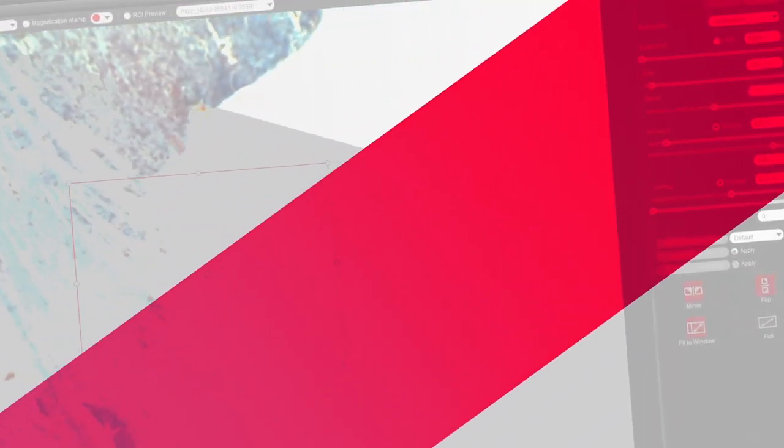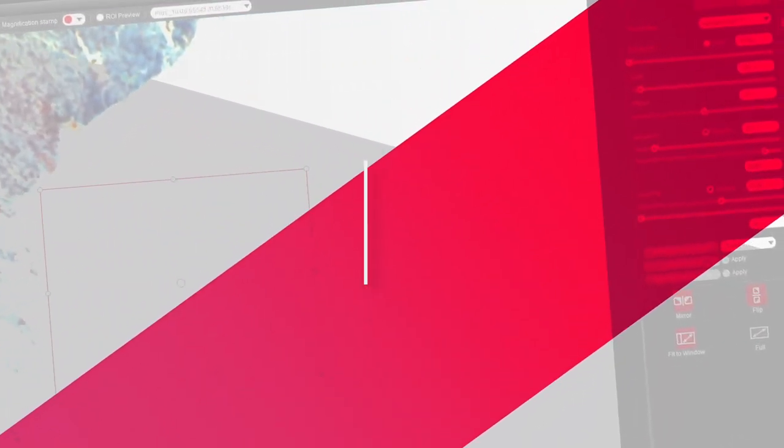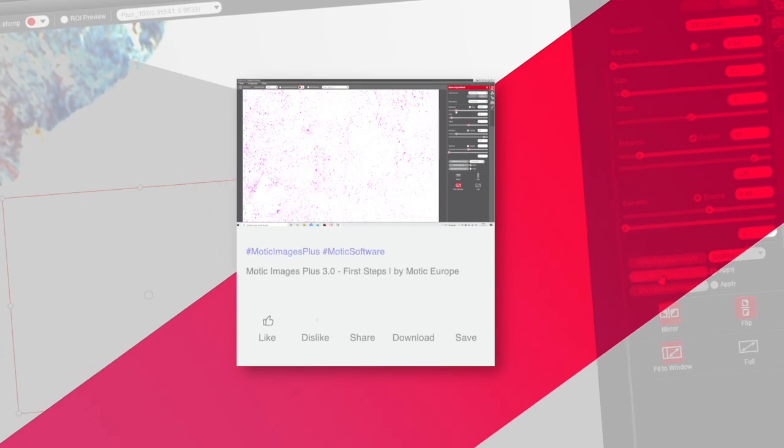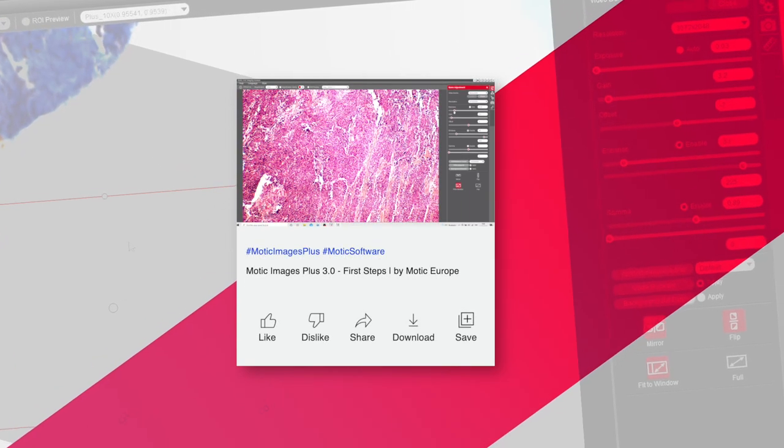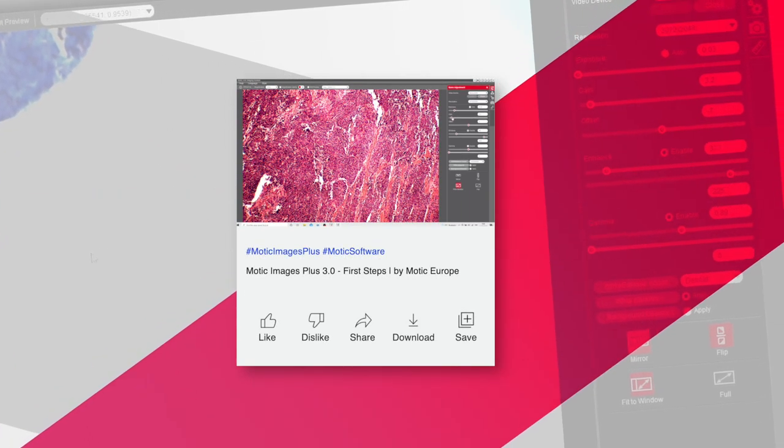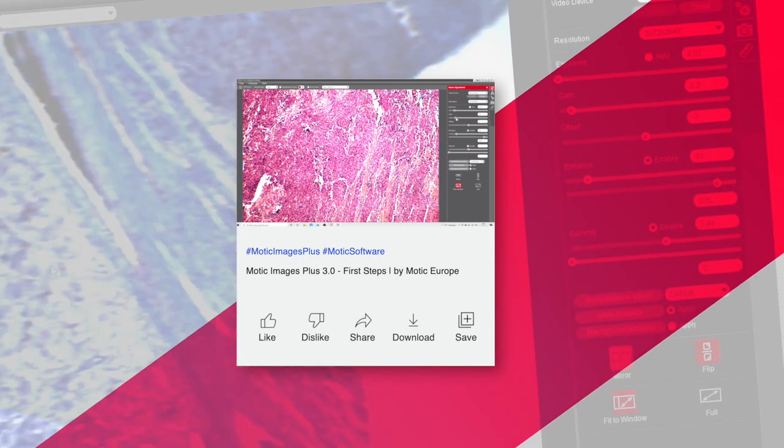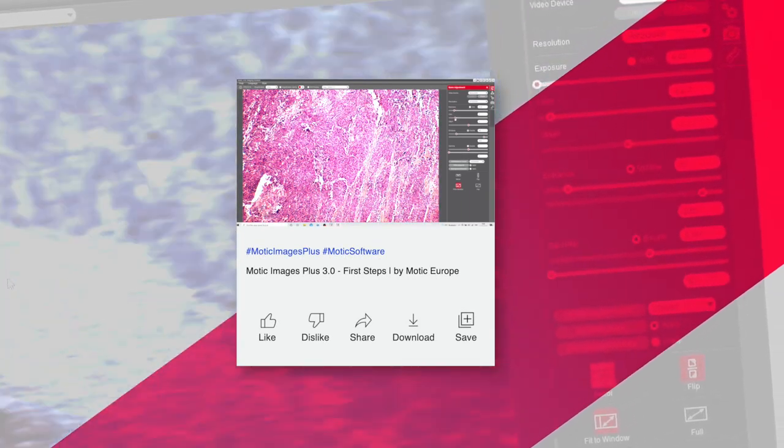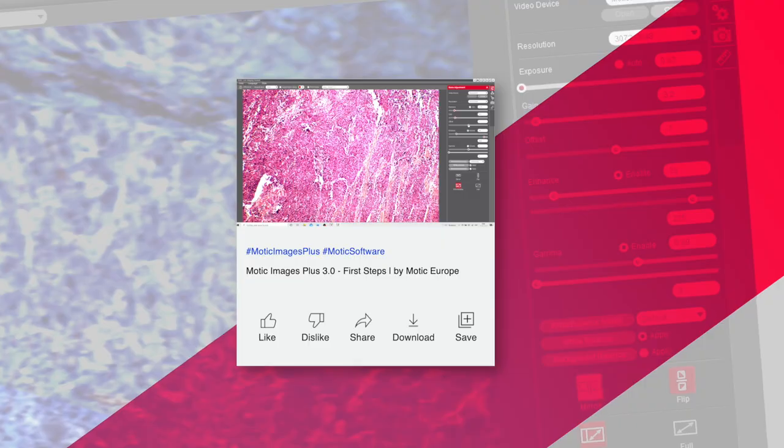For all of you who are looking for basic software functions, please have a look at our video dealing with the Motic ImagePlus 3.0 software. Let's start.